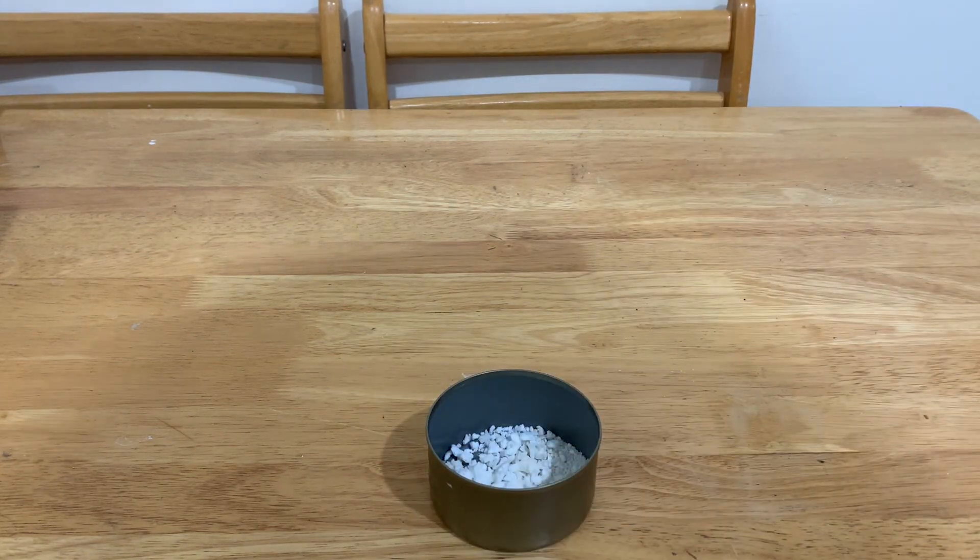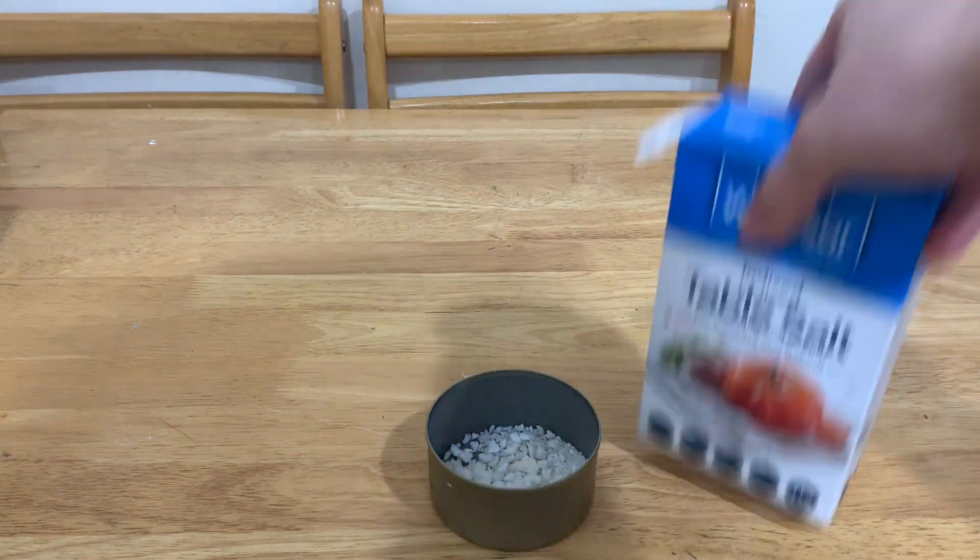Well, hello! As the saying goes, waste your time wisely. So today I will be teaching you how to make sodium hydroxide from regular table salt.